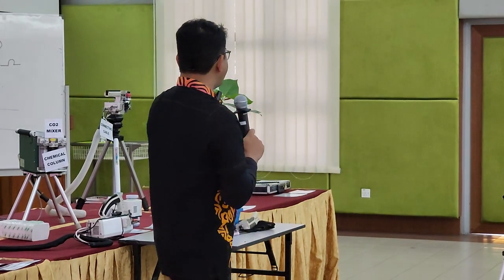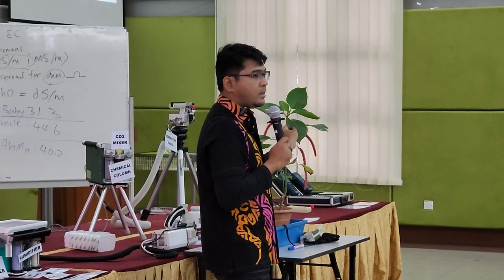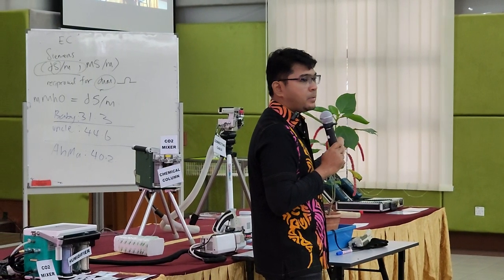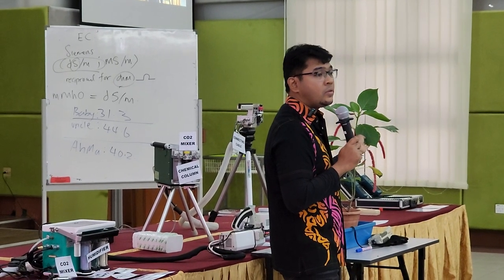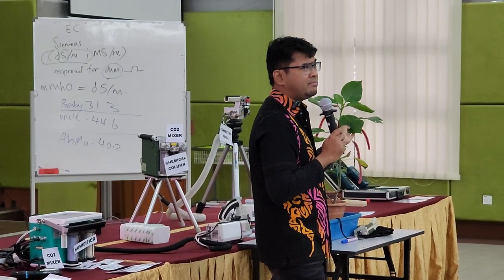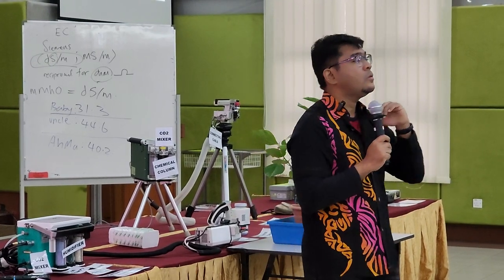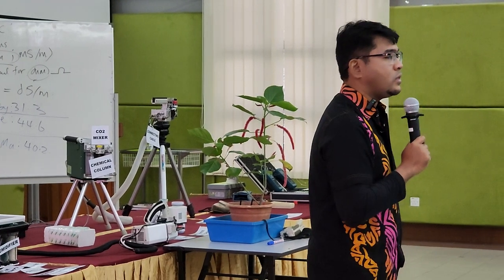Not only chlorophyll, you know, all the pigments present in the leaf. There are many colors. Just because it is green, do not be fooled by the green color. Other colors are present in here. You got anthocyanin, which is purple-red. You got carotene, which is yellow-orange. You got xanthophyll, which is yellow. What else? Pheophytin, which is gray. Okay? All right? So, that's how you do it for the cactus and difficult plants. Does that answer your question?